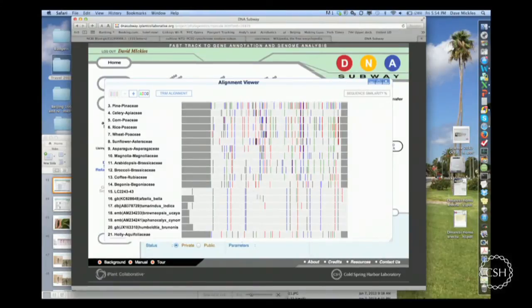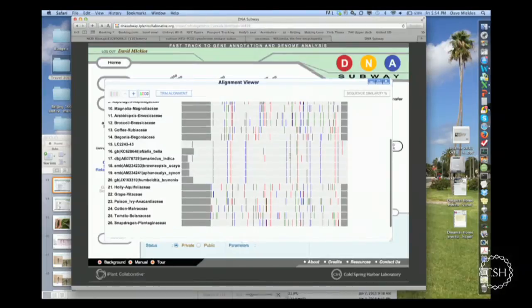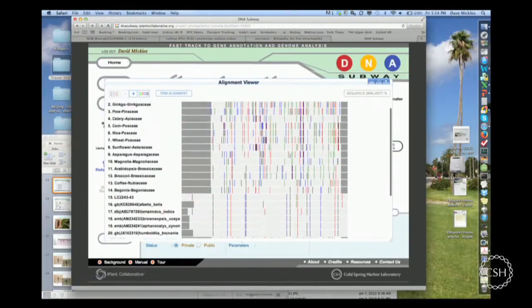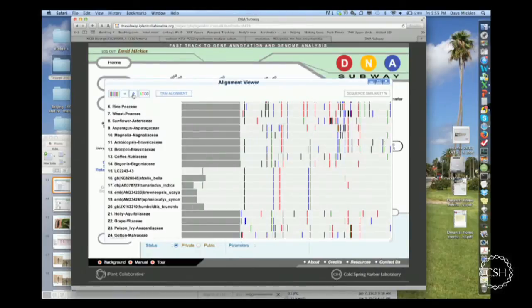However, what's nice about it is when you come down to this group that shook out of the blast search, you can see that they're all related by a similar barcode. And this is the nice thing about generating barcodes for a bunch of plants or animals at the same time. Now, what you'll see if I focus in is here's my plant, the Akparata. Here's the Afzelia bella. And if we zoom in a bit using this feature up here, I'm going to focus.